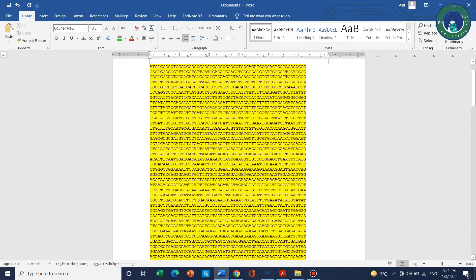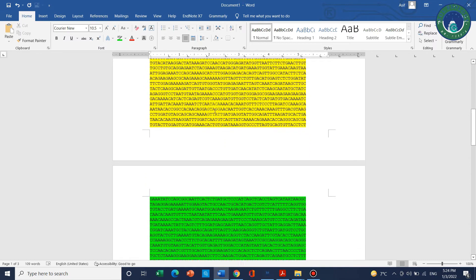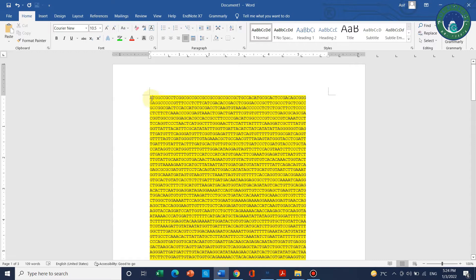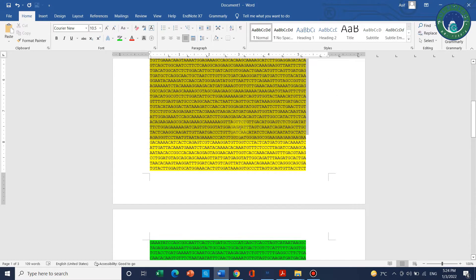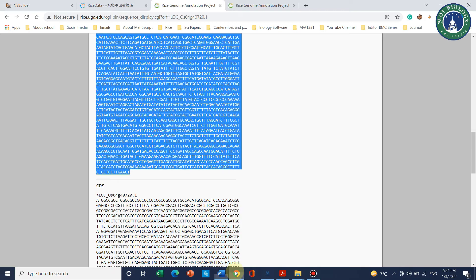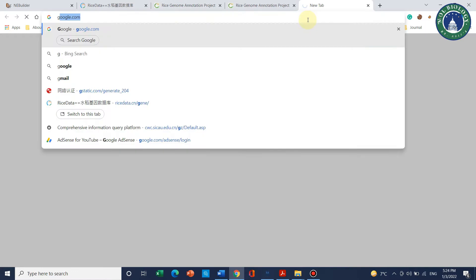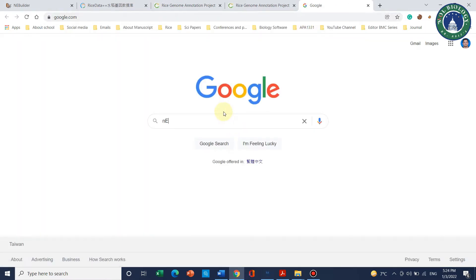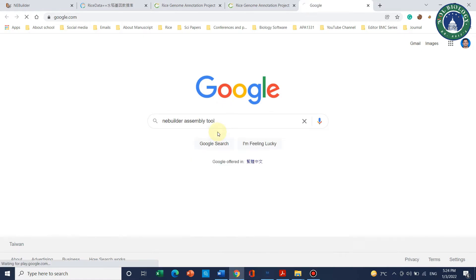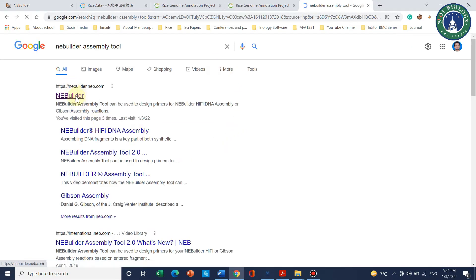To design primers for this gene in two fragments, we will copy the first part of the sequence. Then we will go to Google and search for NEB Builder assembly tool — the first link will be the NEB Builder.